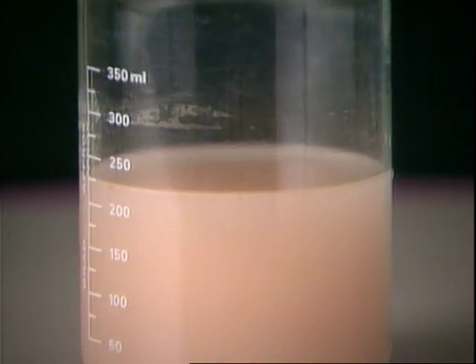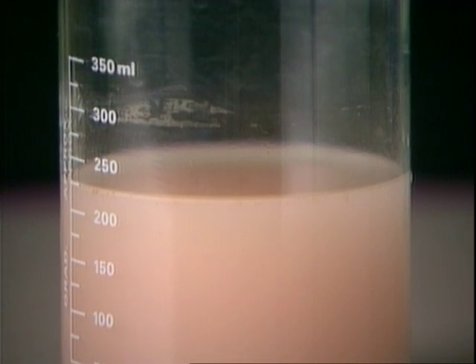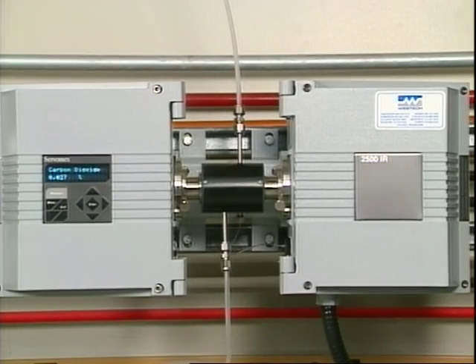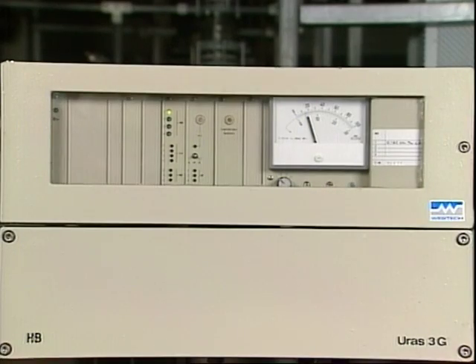Spectroscopic analyzers are often configured to measure a single process component. However, some analyzers can measure multiple components by scanning at various wavelengths and measuring absorption at those wavelengths. Other factors such as cell length and detector type are selected to be appropriate for each component and concentration level that's to be measured. The elements of the spectroscopic analyzer can be arranged in a variety of ways. With each configuration, both measurement and reference wavelengths of radiation are necessary for analysis.